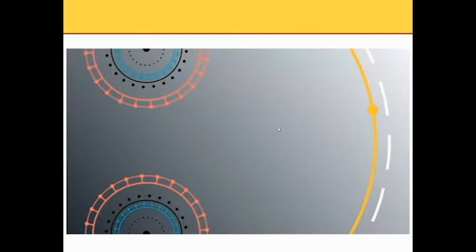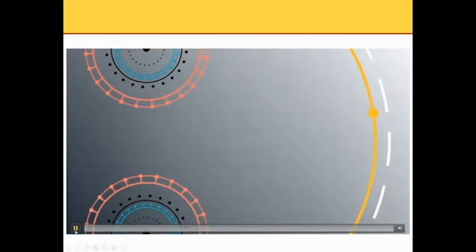Okay. Because SDS-PAGE electrophoresis is so important, I'm going to show you a video about gel electrophoresis, because later on we will discuss two-dimensional gel electrophoresis. It's all the same principle, but the one-dimensional SDS-PAGE gel will be the foundation. Okay, so we will watch this now.